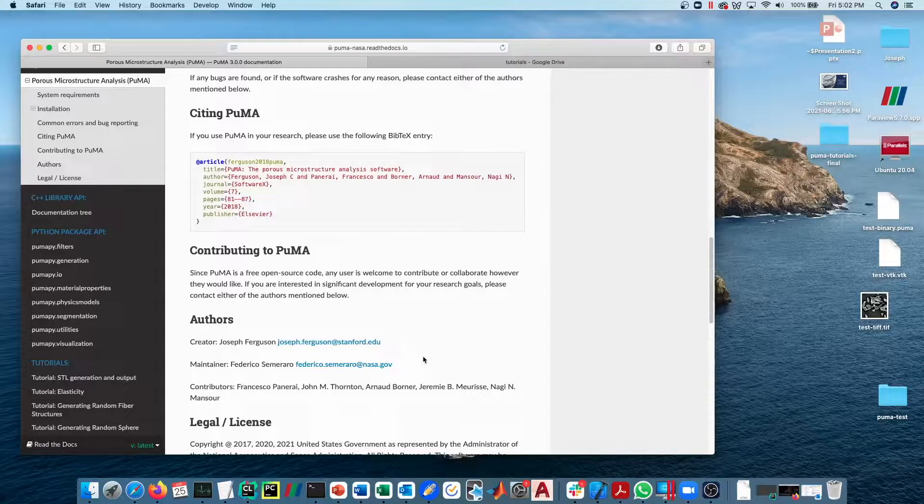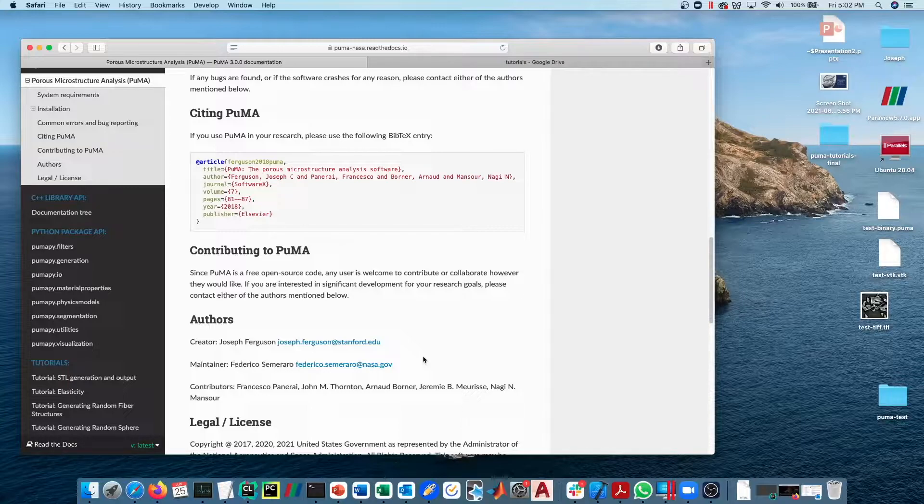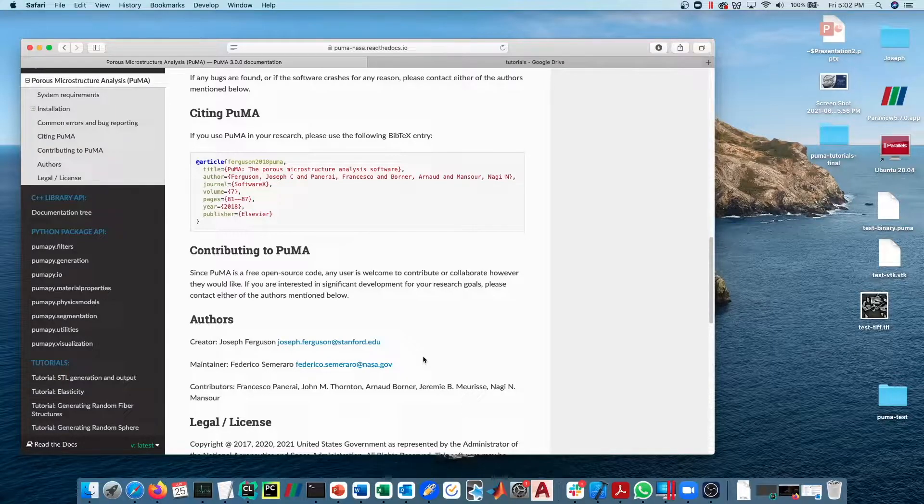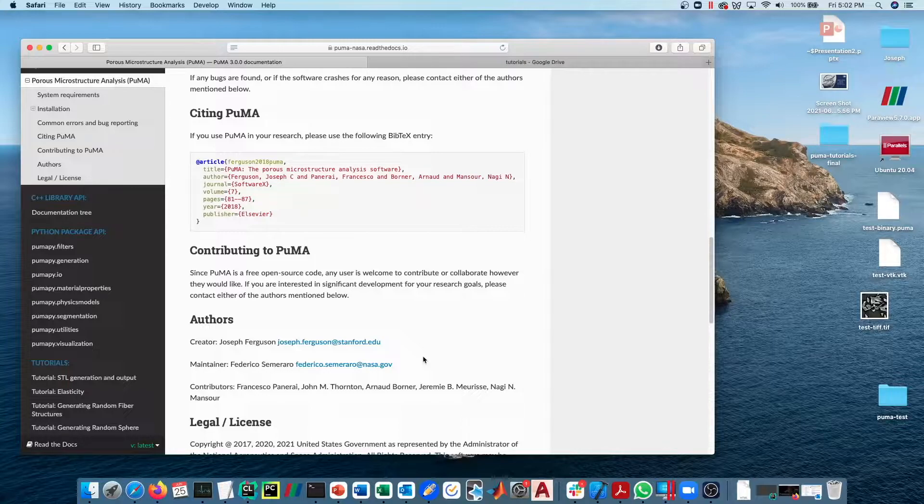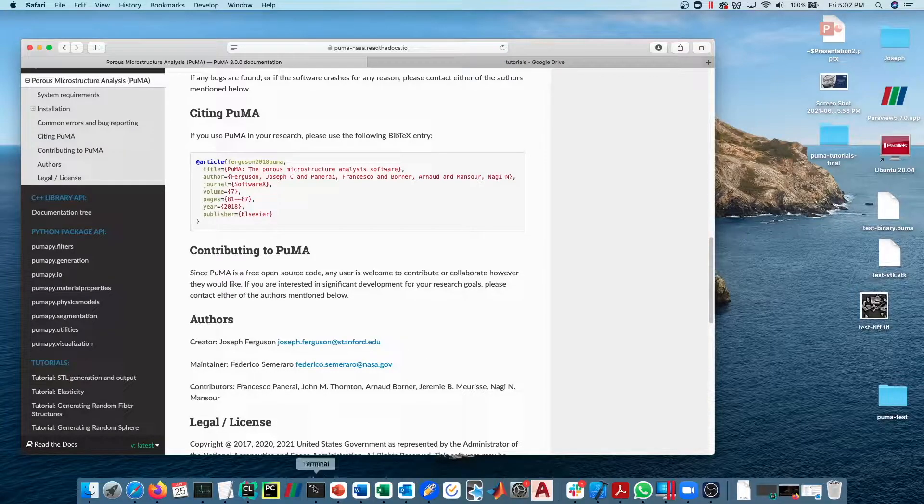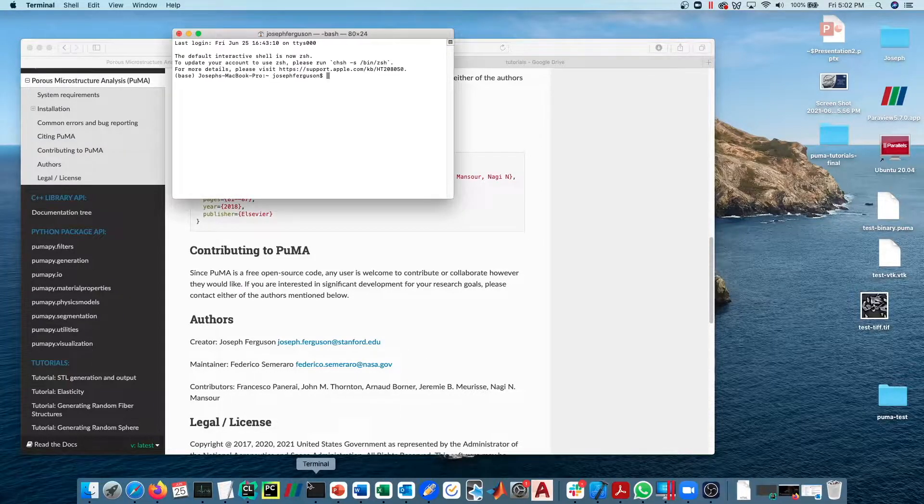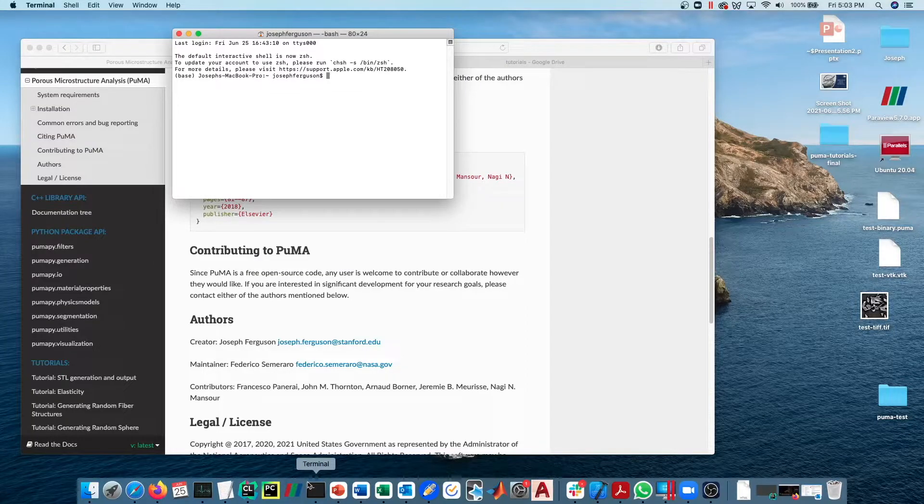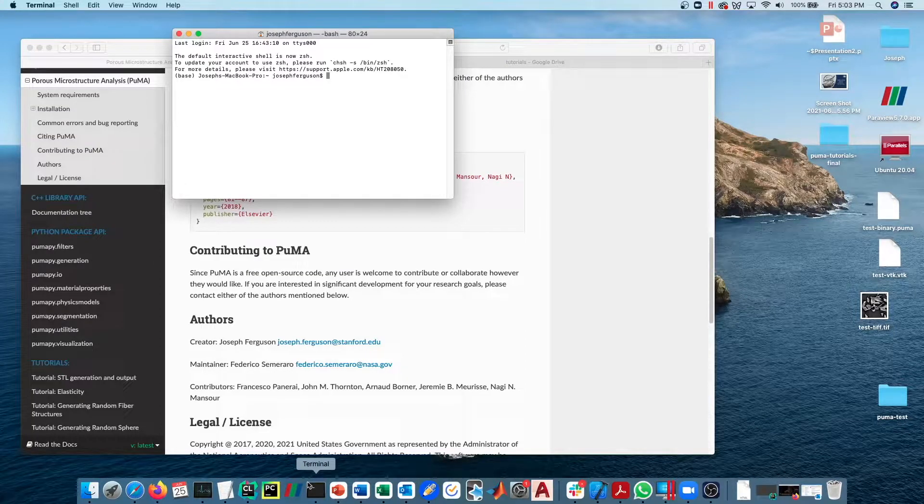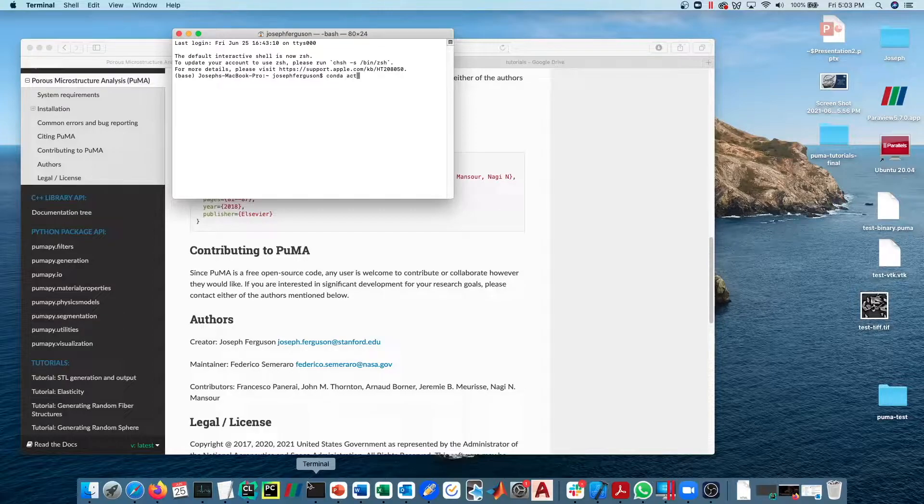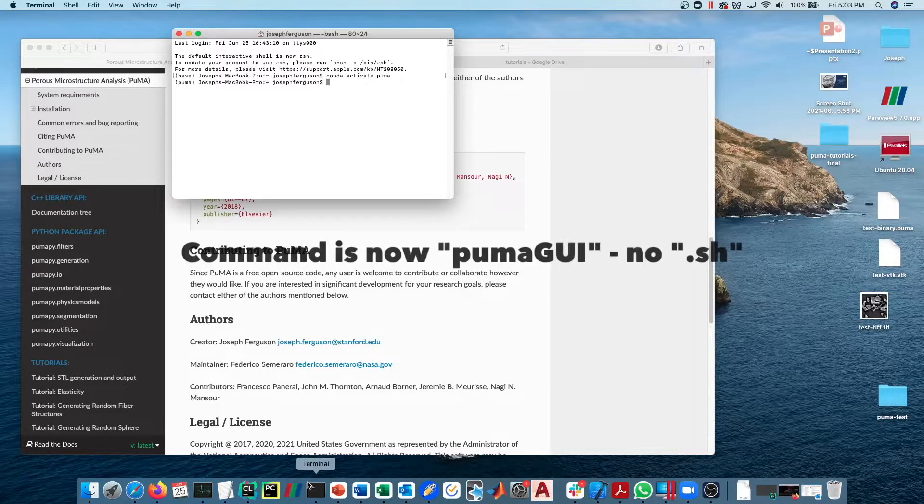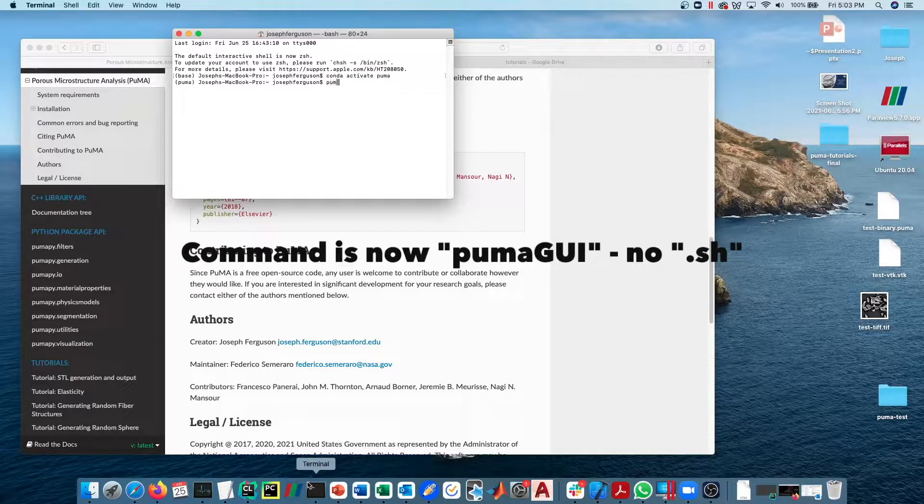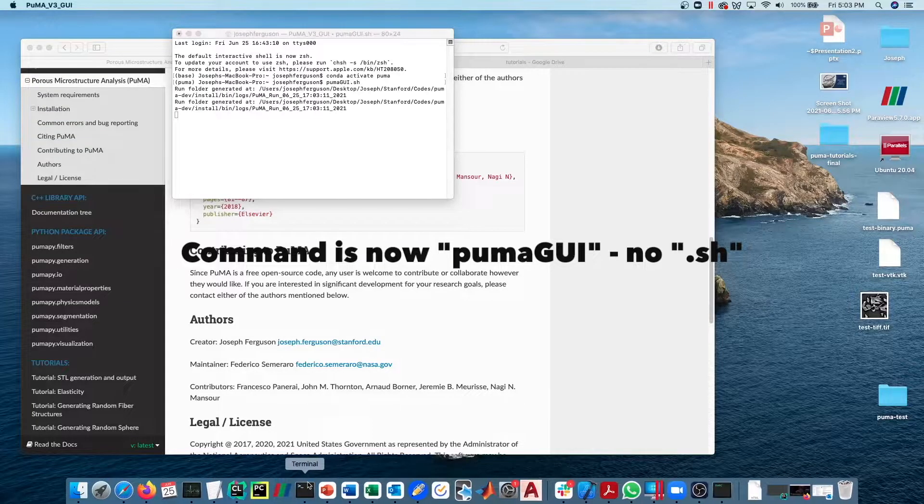Now for the continuum tortuosity, which is just a measure of how much a material resists diffusion, we can calculate this quite simply in the PUMA GUI. If you open up a terminal, type in conda activate PUMA and then type in PUMA GUI dot sh.